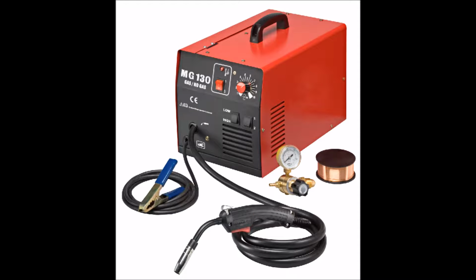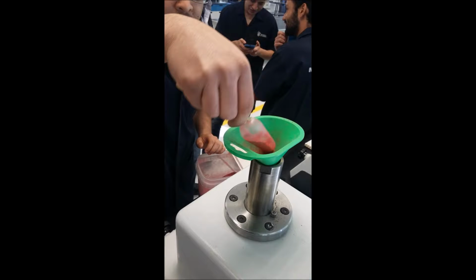Practice 3, microstructural change during arc welding. The objective of this practice is to evaluate the microstructural change of the plate with the welded steel through the process of electric arc welding. For this practice, we'll be using steel plates, electrodes for welding, silicon carbide, cloths and microcloths, and phenolic resin.